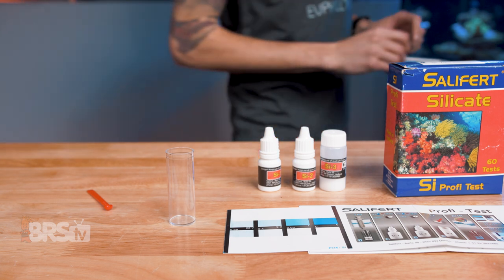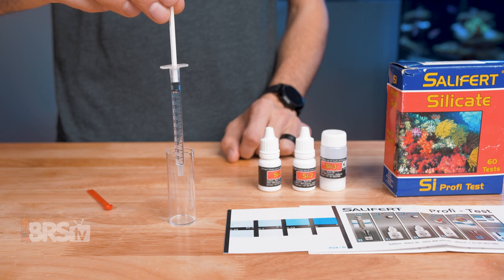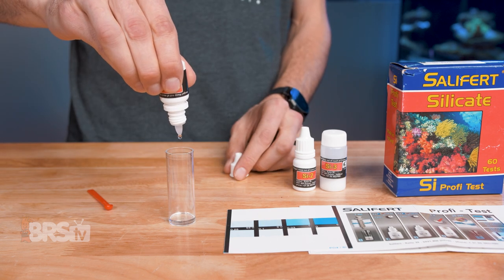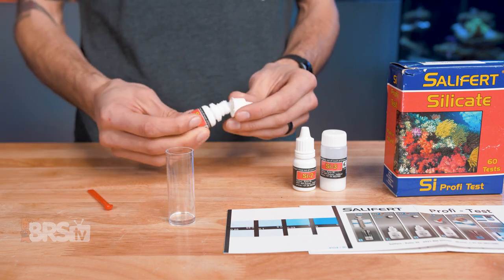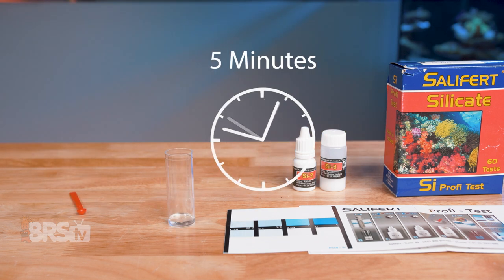To perform the test, first collect one milliliter of sample water from the aquarium using the one milliliter syringe and add it to the test vial. Then holding the bottle completely vertical, add four drops of SI1 to the vial and then swirl the vial gently for 10 seconds. Next, set a five minute timer and wait.